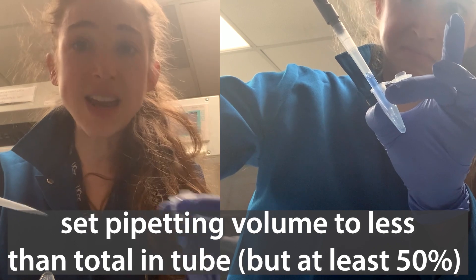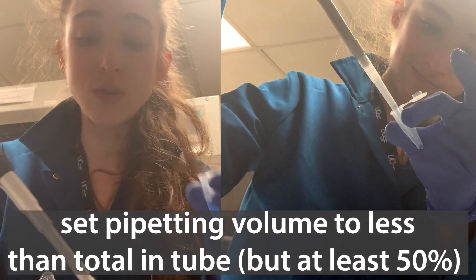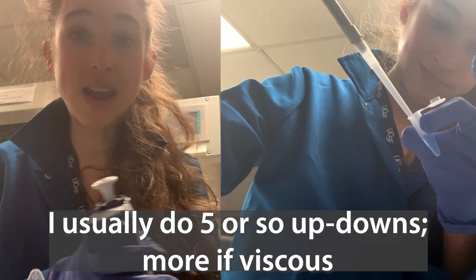What you want to do instead is set your pipette to a lower volume than you have in your tube. This is going to allow you to mix correctly — mix it thoroughly without letting in air.